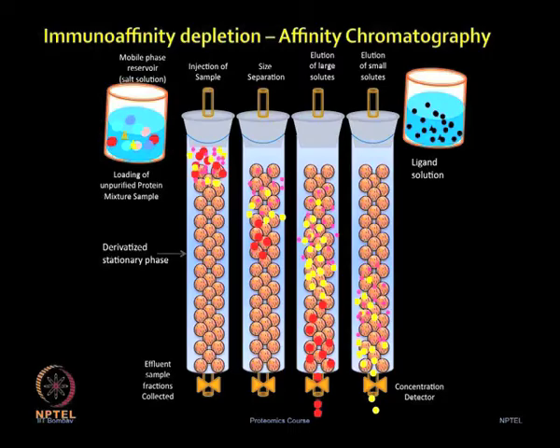So, to eliminate those high abundant proteins, authors used multiple affinity removal system from the Agilent technologies, and they removed most highly abundant proteins from the serum sample, including albumin, IgG, antitrypsin, IgA, transferrin and haptoglobins.